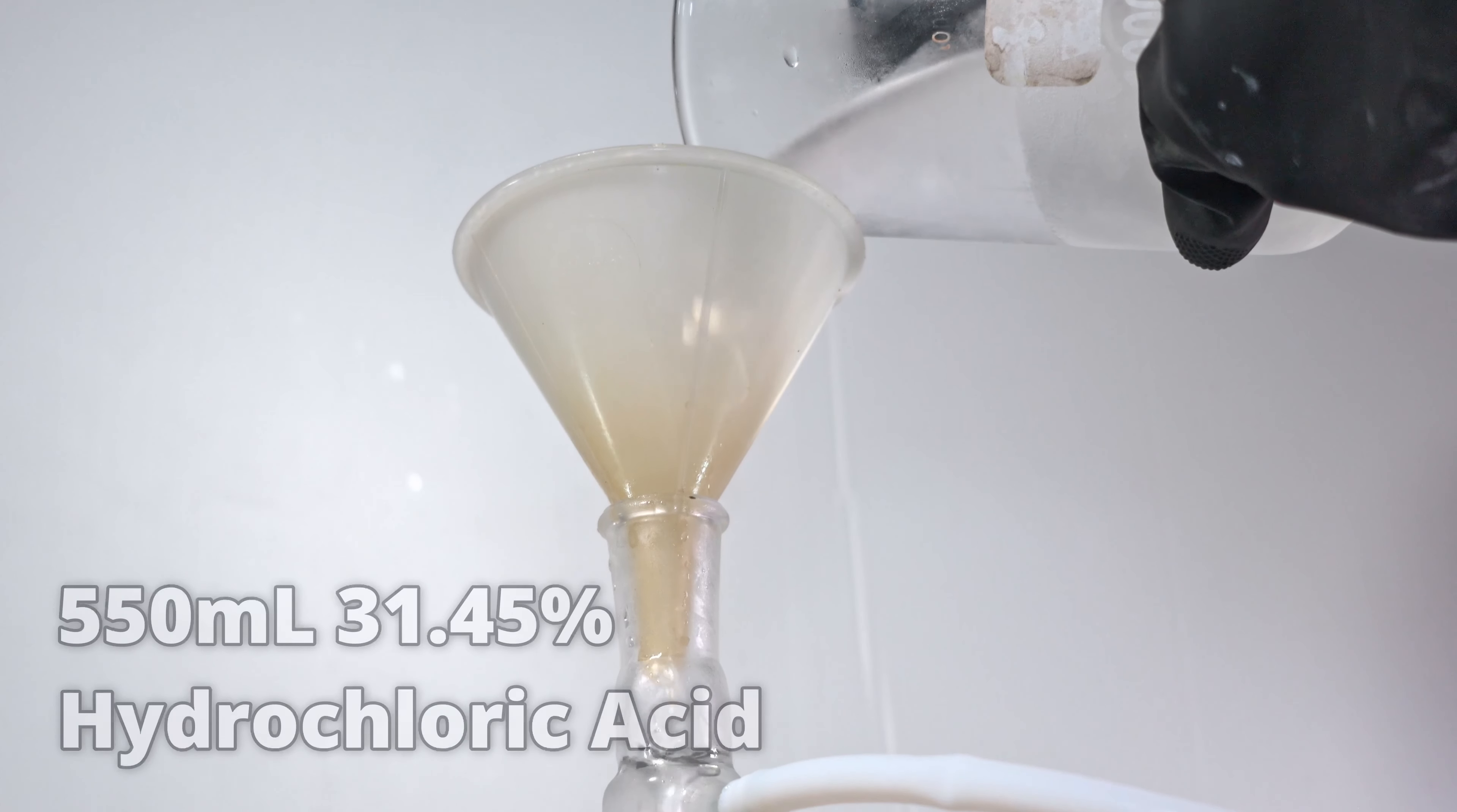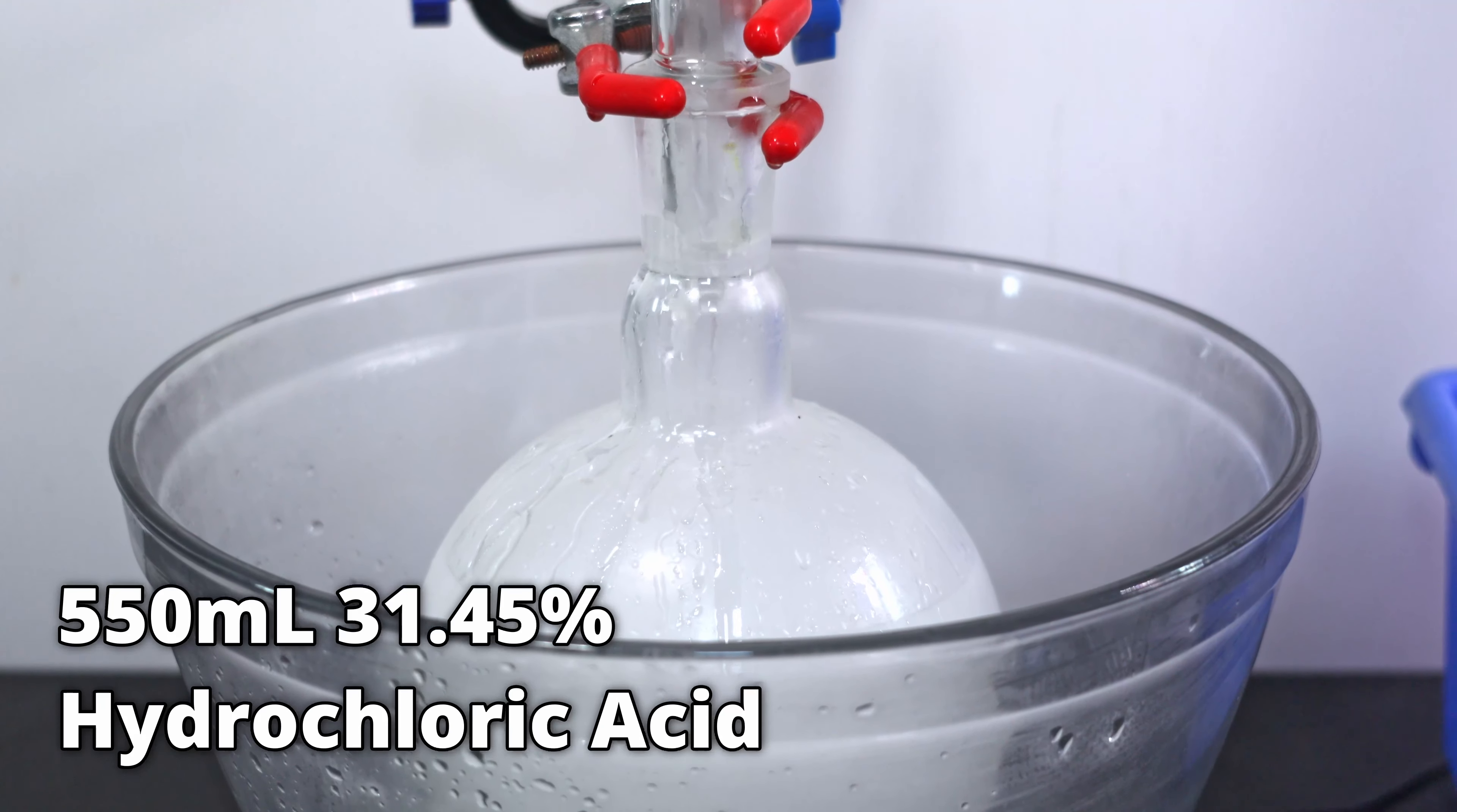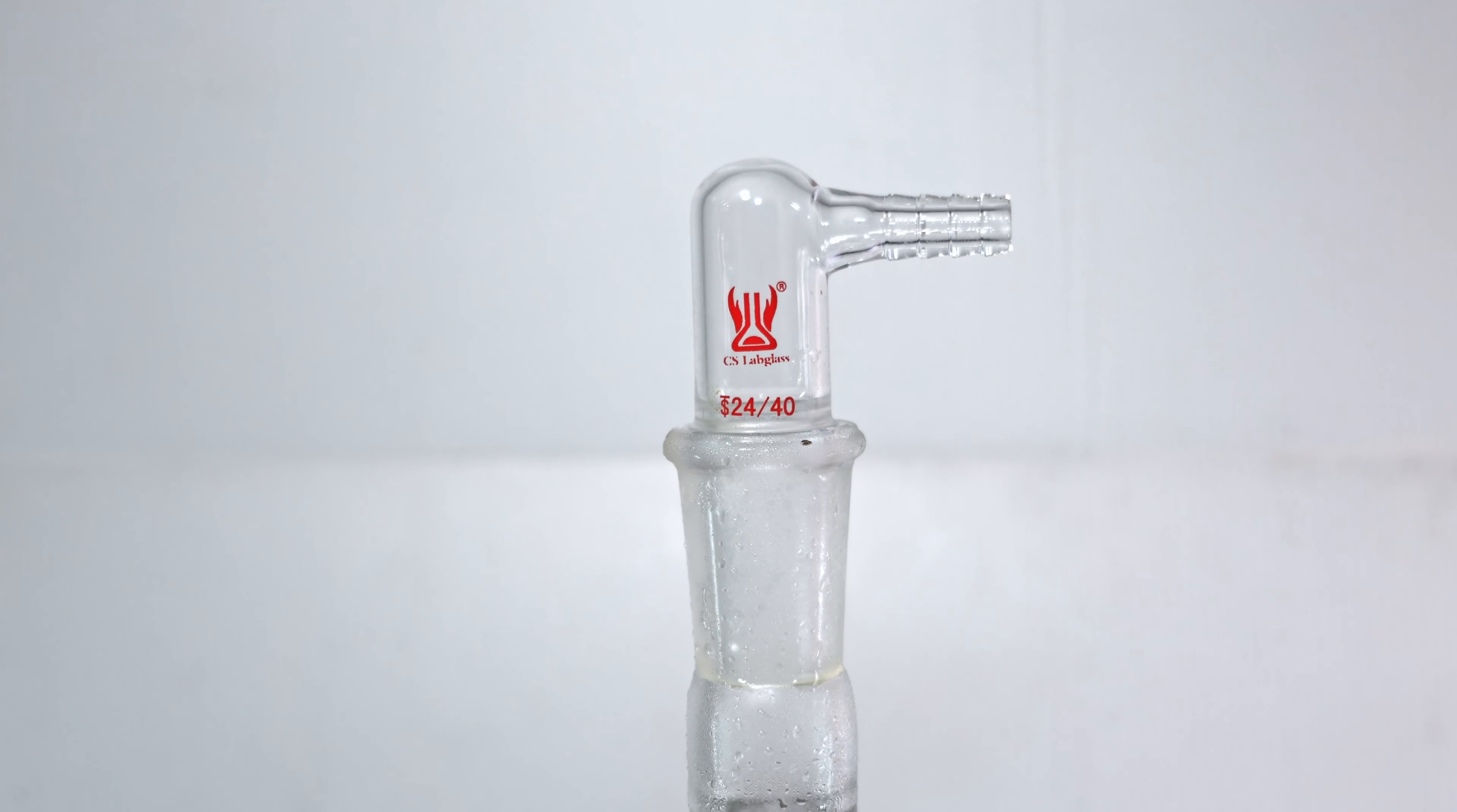Finally, I'm going to put in 550 milliliters of 31.45% muriatic acid. It is important that it be freezed so the reaction proceeds only through SN1. The low temperatures also inhibit hydrolysis of the tert-butyl chloride. After adding it all, I cap it with a vacuum adapter.